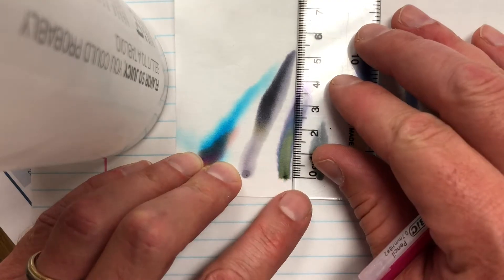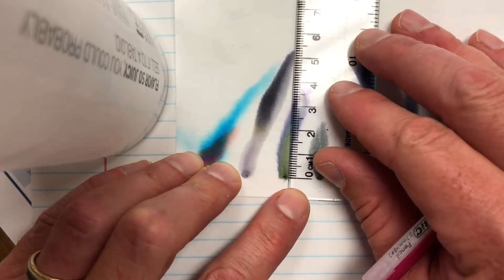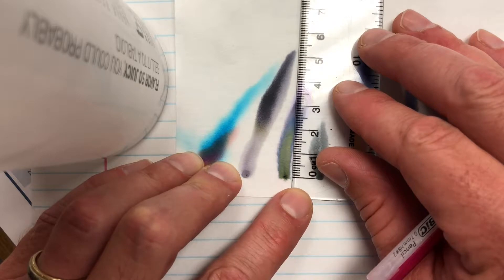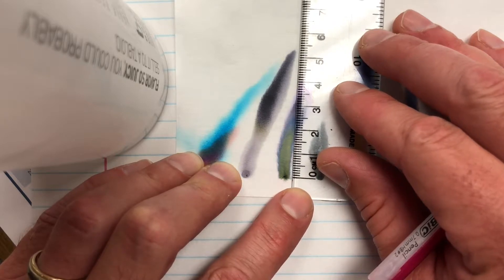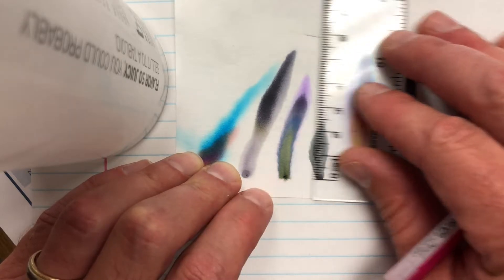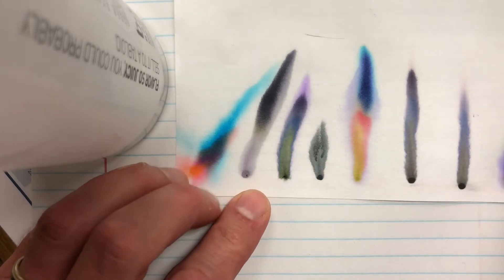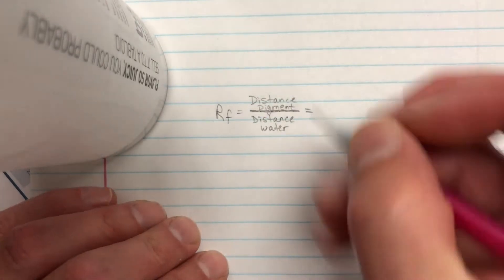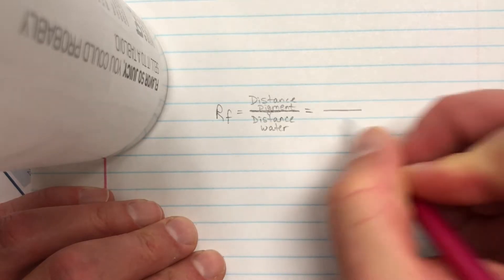So if I take my ruler and I look, I'm right about maybe at 61, 59, 58, so with this I will actually go with, I'm going to go with 61 on this one. So the distance that the water traveled was 61 millimeters.